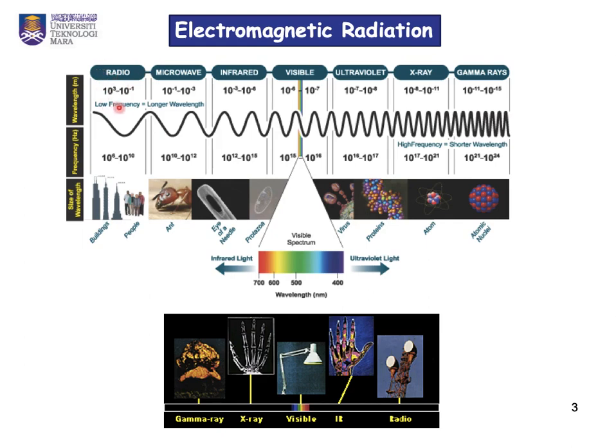Generally, NMR spectroscopy uses radiation called radio frequency radiation, which occurs at the lowest energy, low frequency and larger wavelength. So this is the region of the electromagnetic radiation used by NMR spectroscopy.